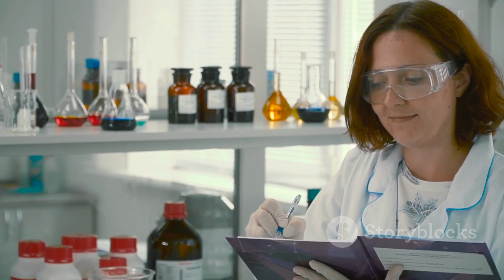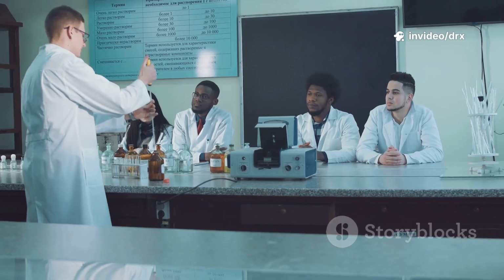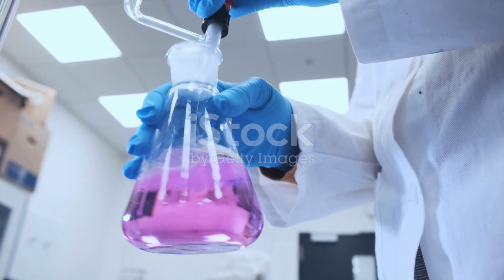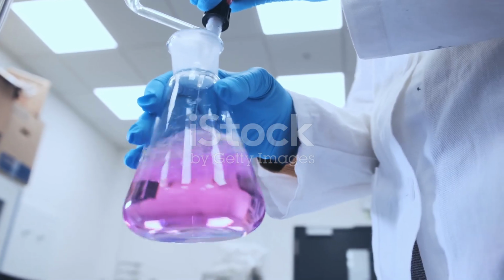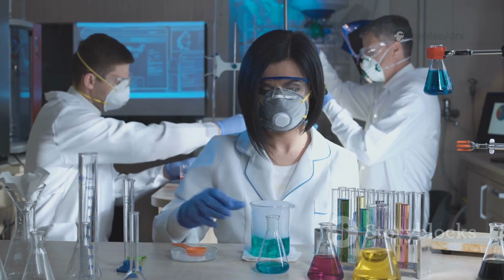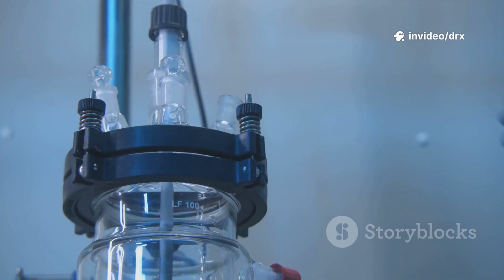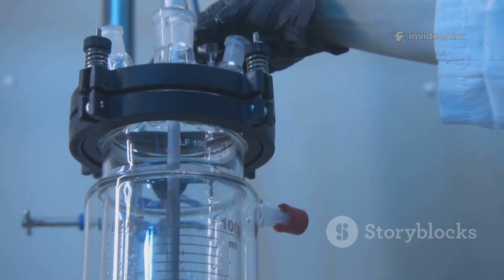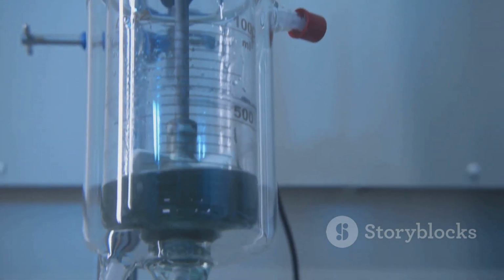Today, let me break down one of the most basic yet absolutely essential topics in pharmaceutical analysis, acid-base titration. So, what exactly is acid-base titration? It's a super common and important method used in pharma labs to check the strength, purity, and concentration of drugs, whether they're acidic or basic. The whole idea boils down to a simple neutralization reaction between, you guessed it, an acid and a base.